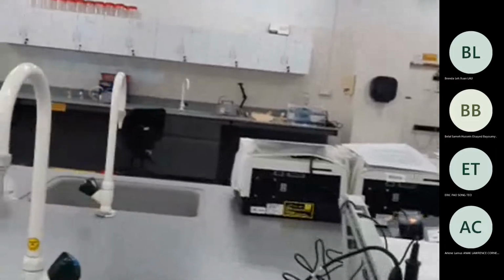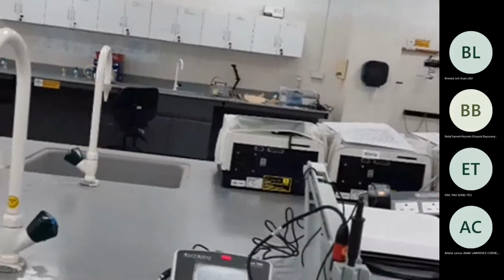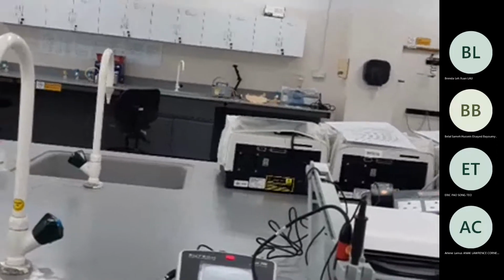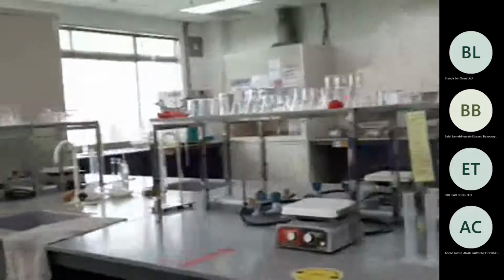So you do, in 4 beakers, right? And in each beaker you take 25 milliliter of water for the second part, and we have to do it faster because we have just 25 minutes to go. Okay, let's see what Vanessa is doing.